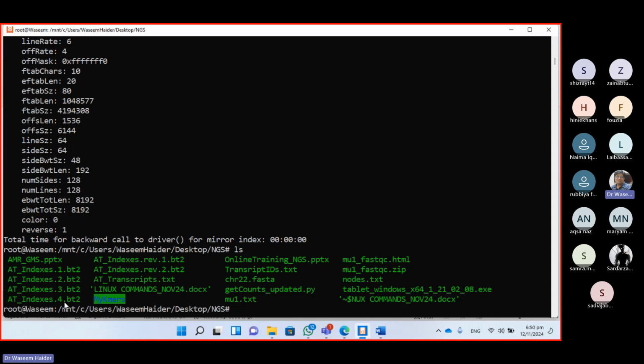And then it takes a read, and for example, in file number one, I am taking the sequences which start with ATG. So now your read fragment starts with ATG. So I don't need to search for it in the rest of the files. I simply go and put it into the chunk from where that common pattern is coming. So that will make my search space easier, right?